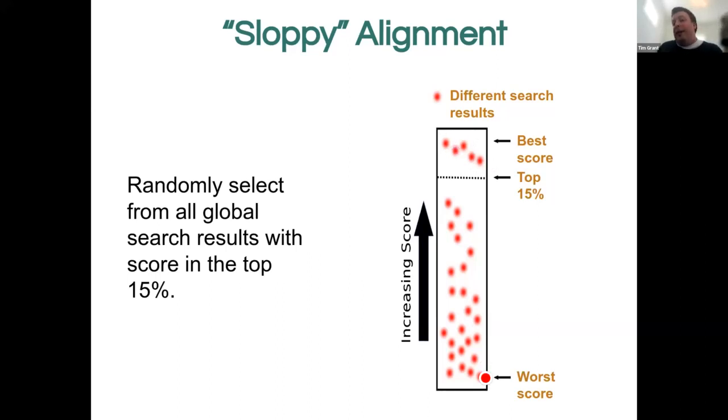What that means is in the beginning, when you have essentially the wrong map, your best score and your worst score are very, very similar. There's no real differentiation, because it all looks kind of the same and it's all kind of wrong. Almost all of your orientations end up in this section, and you randomly select one from a pool of things, some of which will be right, some of which will be wrong.